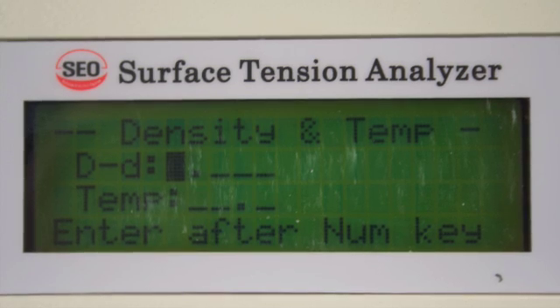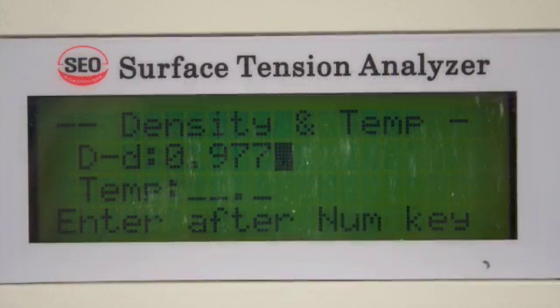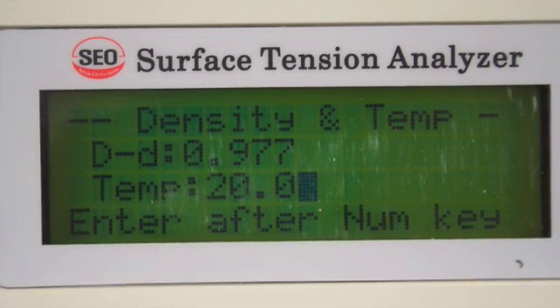Next, depending on the liquid surface being tested, enter the density and press ENTER. Enter the temperature in Celsius and press ENTER.